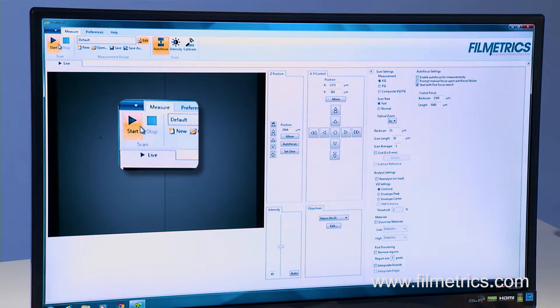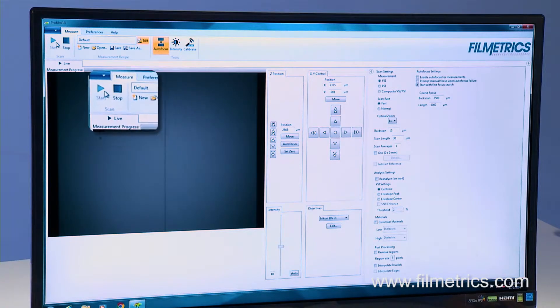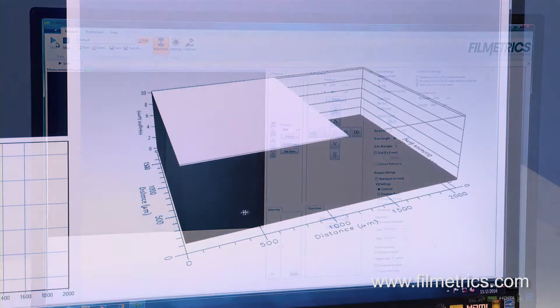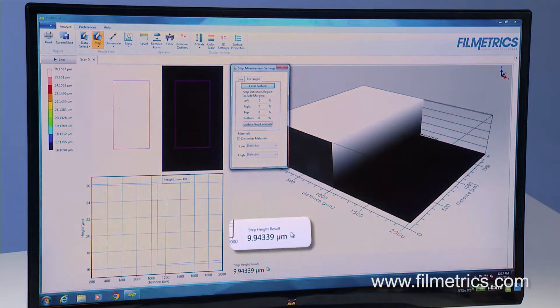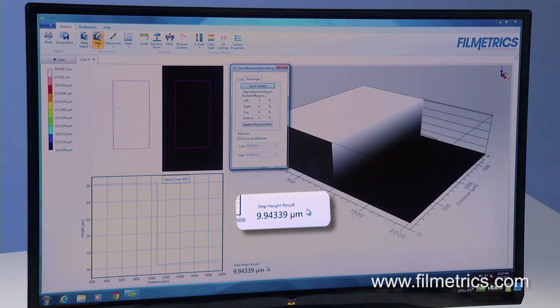Simply press the Start button and the Profilm 3D automatically acquires the data. The step height is shown conveniently on the right, and that's it.